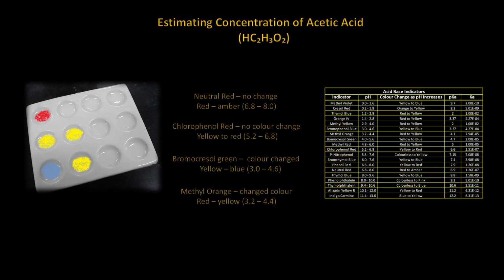and 4.4. To replicate the last test, methyl orange was added and the color did change. By a process of elimination, the estimated pH value is somewhere between 3.2 and 4.4. Next slide.